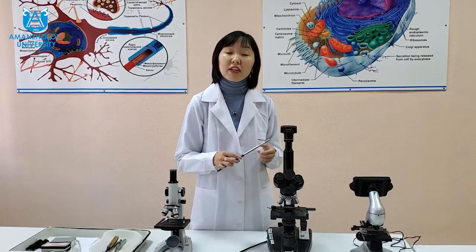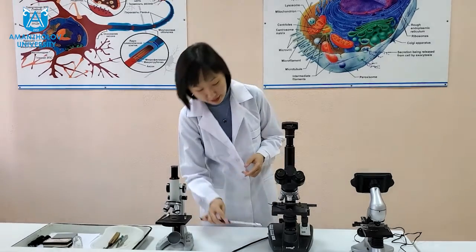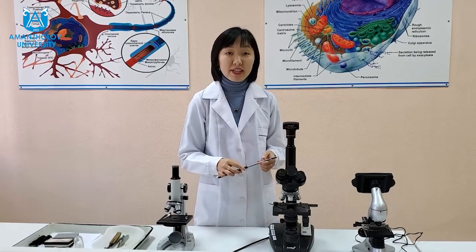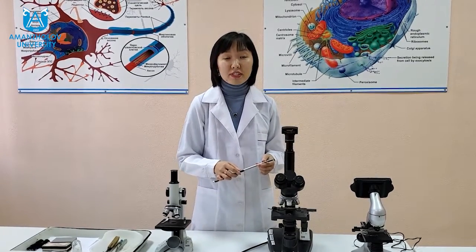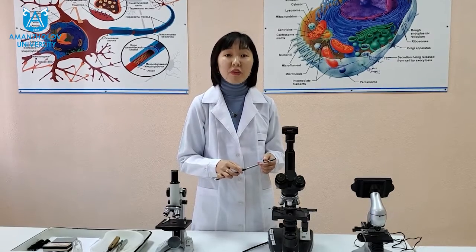With a built-in transmitted light illumination system, the collector part is located near the light source at the base of the microscope and is designed to increase the size of the luminous body. The condenser optical system is designed to increase the amount of light entering the microscope. The condenser is located between the object and the illuminator. A condenser always has an iris diaphragm, and the numerical aperture marking is applied to the frame of the condenser.